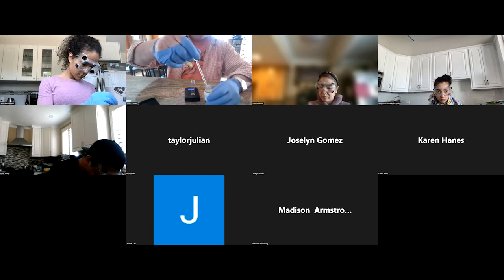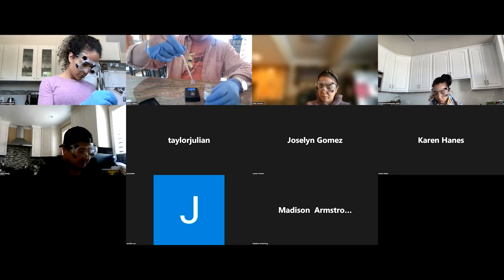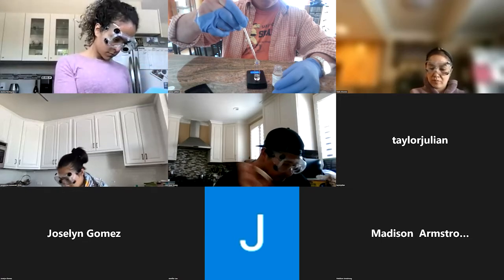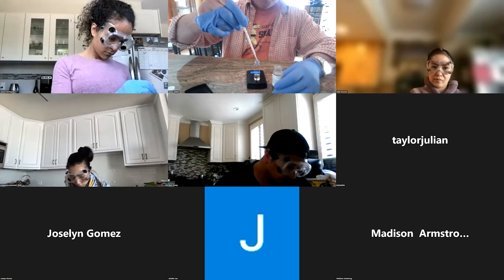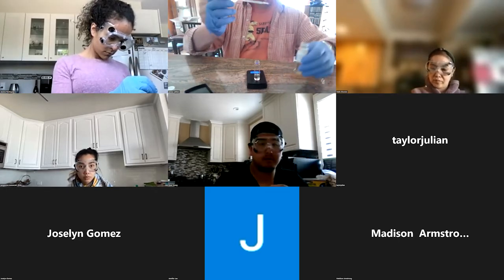And then get about 2 grams. It's pretty close. 1.94, I'd say that's close enough.